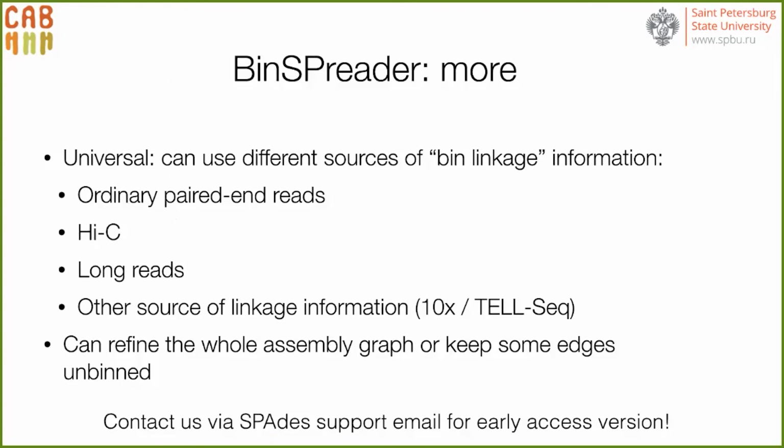So currently we are using only assembly graph information for bin refinement, but basically the same algorithm can be adapted to different types of genomic data, such as the ordinary paired-end reads, Hi-C, long reads, read clouds, and so on, which sets ground for the future work.